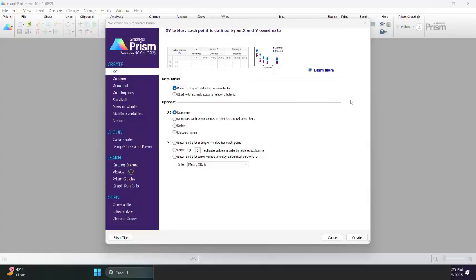So when you open the software, GraphPad Prism, the first page that you encounter is this one. Here in this column, down here in the create part, you can see different kinds of tables and graphs. As you see, XY graph is shown here, and up in here you can already see how the graph and the table would look like.